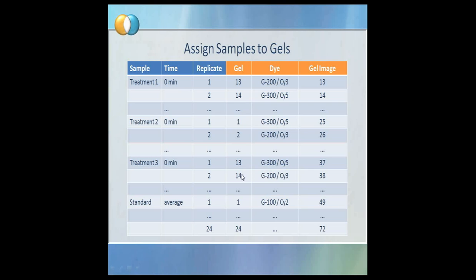We add in the opposite way the remaining open dyes to certain samples so that we fill the 24 gels times 2 dyes, and then also we have to have enough standard sample, that means an average mixture of our 4 cell lines across all the points in time.